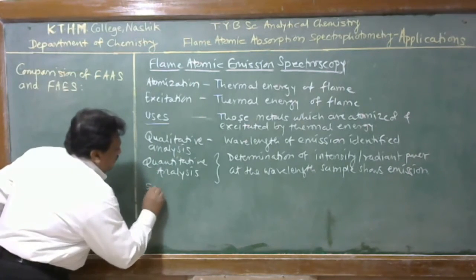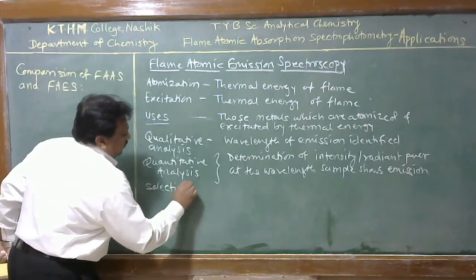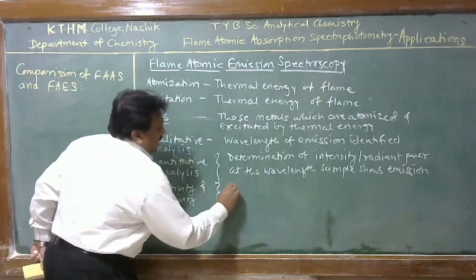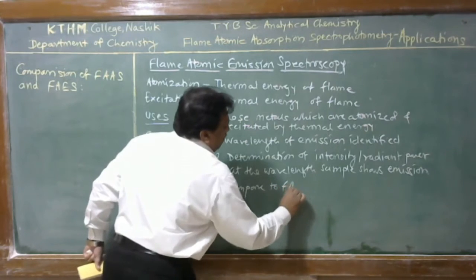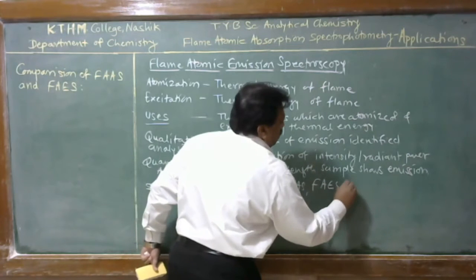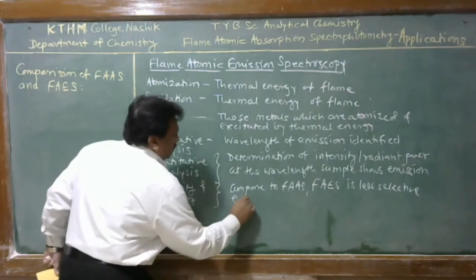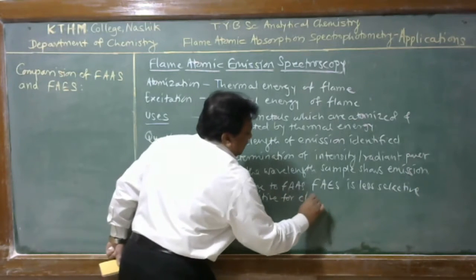Now next we can consider the selectivity and sensitivity. Compared to plain atomic absorption spectroscopy, plain atomic emission spectroscopy is less selective and sensitive for chemical analysis.